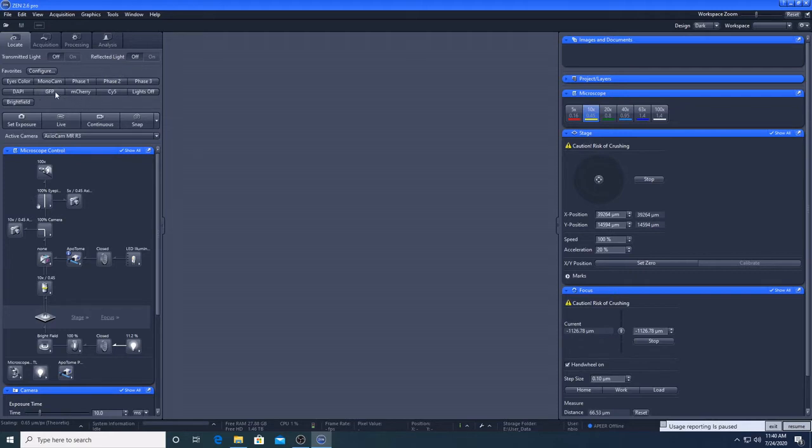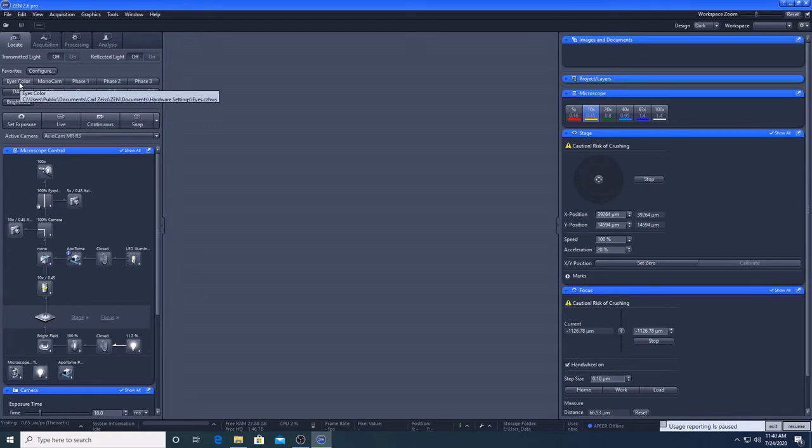Here are some buttons for different channels for viewing our sample. The channel contains a setting for a filter, a light source, exposure time and a detector which will either be our eyes or a camera.